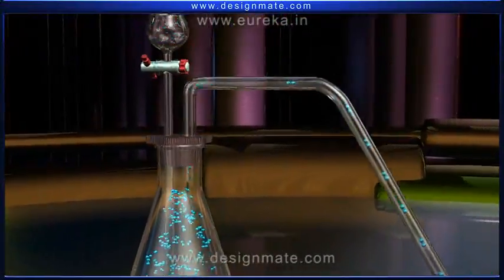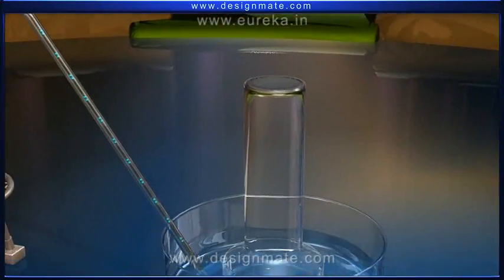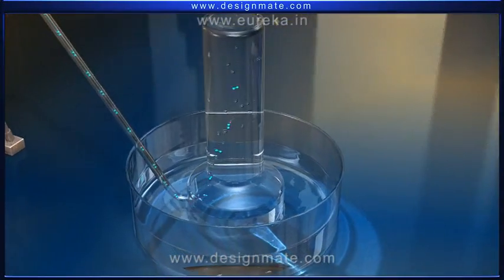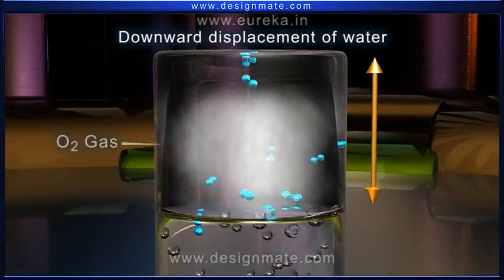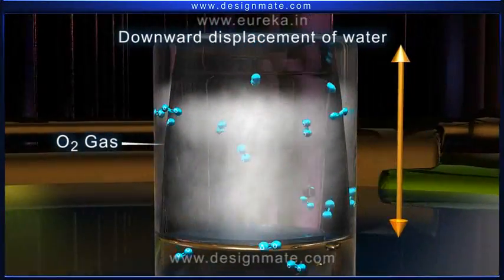The released oxygen gas passes through the delivery tube, then over water and starts getting collected in the gas jar. This method of collection of gas is called the downward displacement of water.